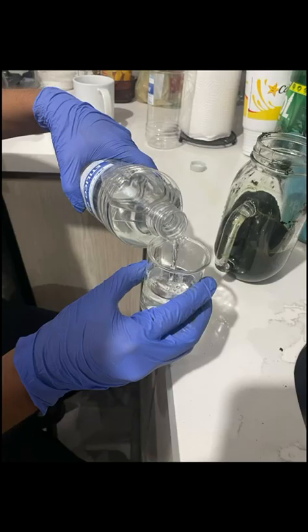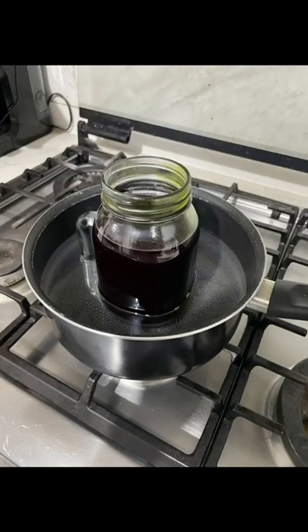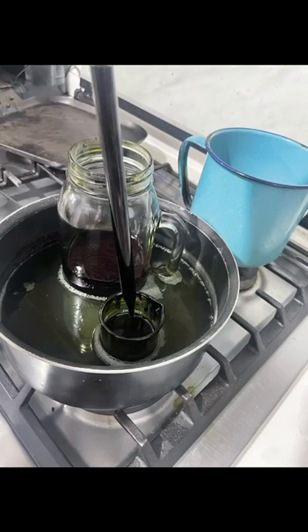We repeat the process with 200 milliliters of new ethanol to perform a second extraction with the residue from the previous extraction. Then, we combine both extracts and remove the solvent using a water bath at a temperature less than or equal to 45 degrees Celsius until we obtain an oily residue. We weigh the oil obtained to calculate the percent of lipids.